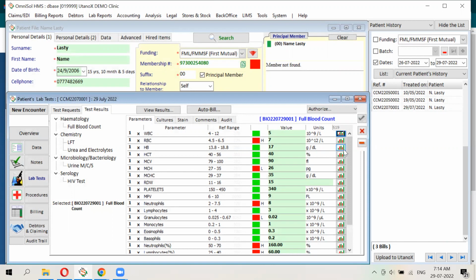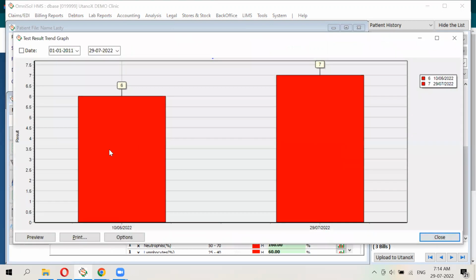As many as, this is actually governed more by the screen size. The system doesn't have an actual limit in terms of how many it can capture. However, the space or printout has a bit of a limit because of the width. That becomes a physical restriction, but you would have already shown the last about 200 tests or so.